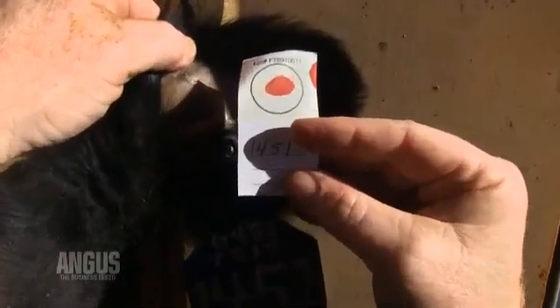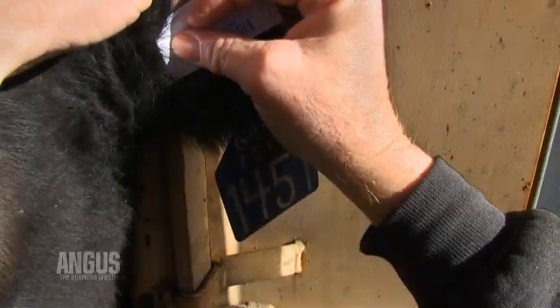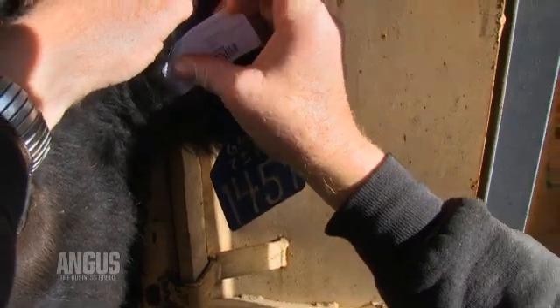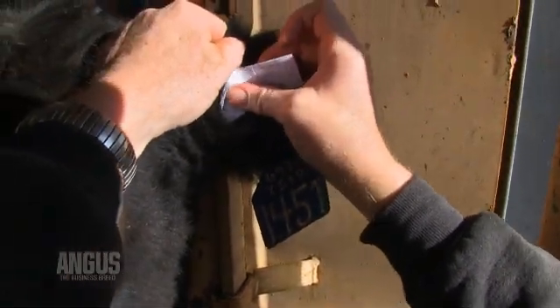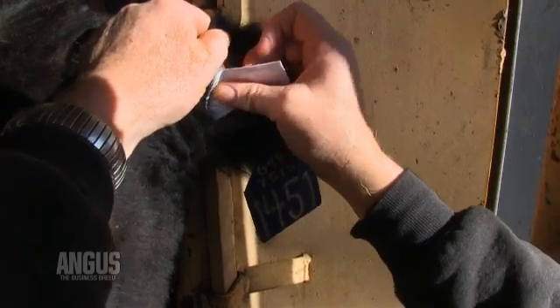And with that, I've got a sufficient sample. Ideally, I'd like to have a little more blood on that card, but it will work. Depending on what your time element is, the blood will continue to well up on the inside of the ear, and you can continue to put more blood on that card.